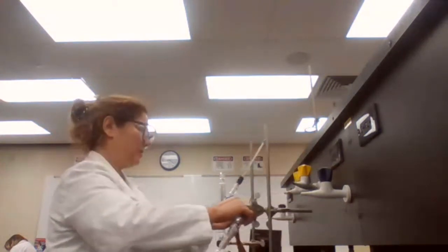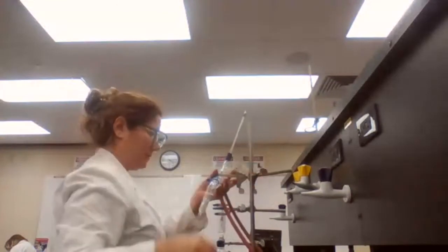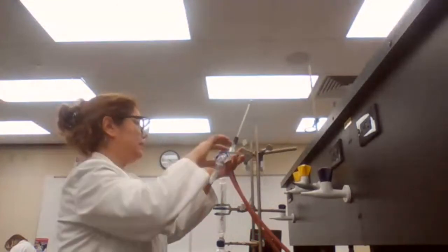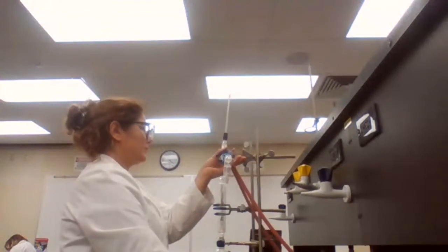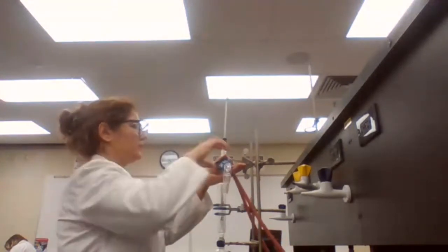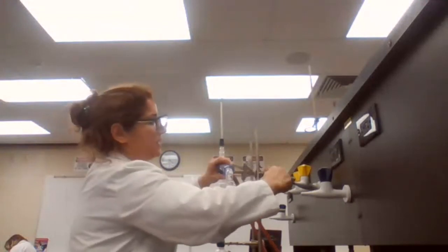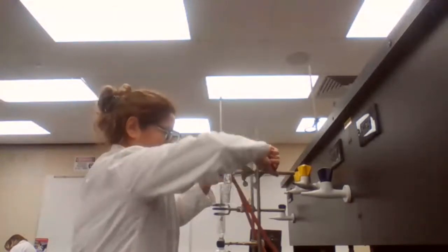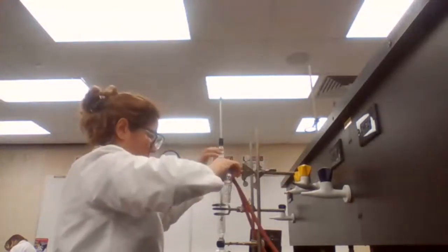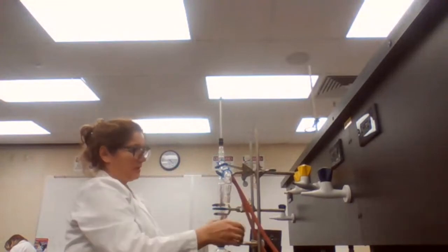So this one has to go up high enough to fit the distillation head. I make sure my glassware is secure.